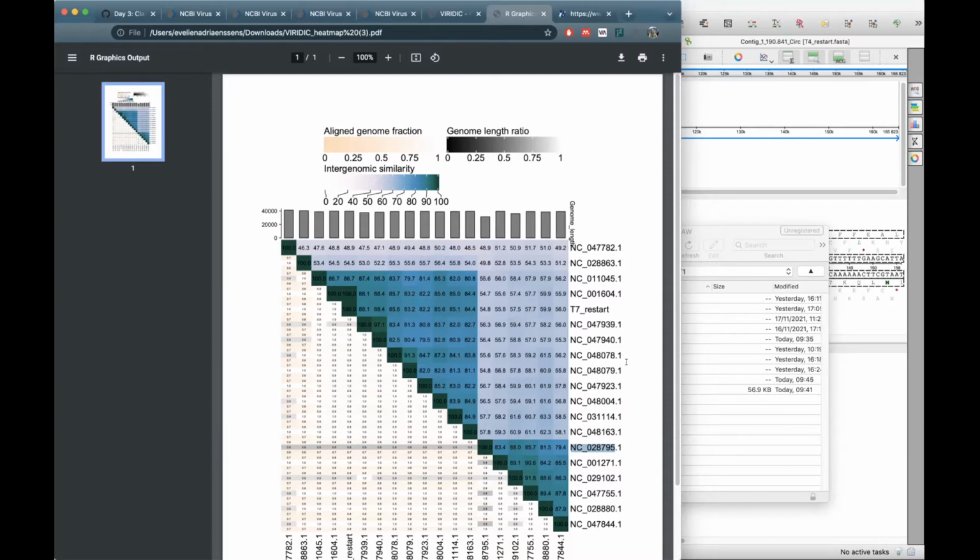I would always just put that in as one line. So not the picture? No, no, unless what you're doing is reassessing the genus and finding other members that are unclassified in the databases and you want to describe that. If it's just about your genome and it is in a genus that is well defined, in a species that is well defined, I would just say that in one line and you can already see that from the sequencing, from the main BLAST result.